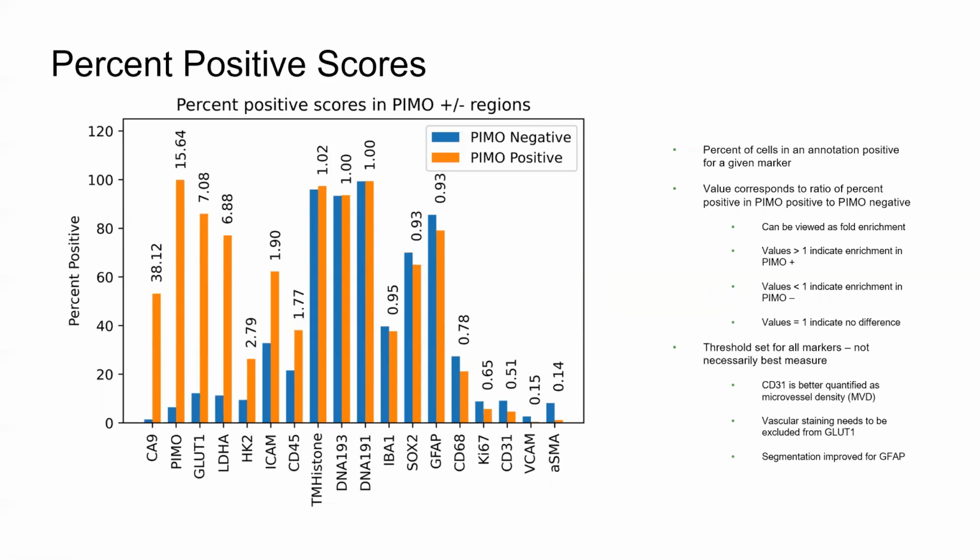Now, this is very unlikely to be a directly crucial part of your own project. What I really want to outline is that we can identify regions within an image and compare scores of various marker intensities across all of these different marker categories across both regions of an image. So ultimately, it depends on how you want to segment regions in your image, if any.